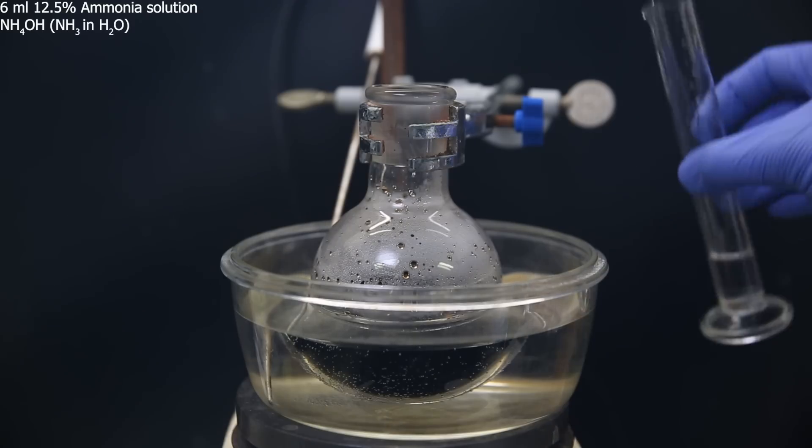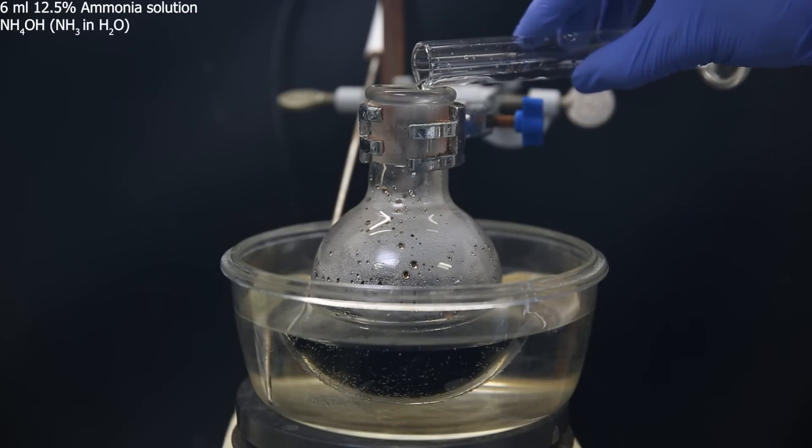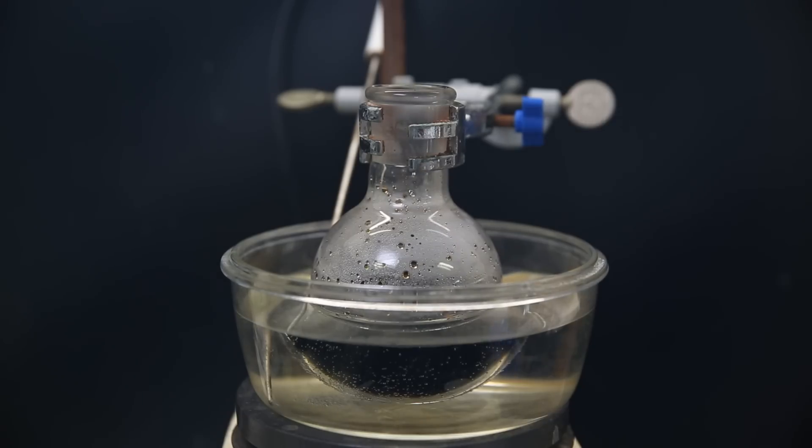Now for the next step, I immediately add 6 mils of a 12.5% ammonia solution. Then after a short delay, a yellow precipitate forms.